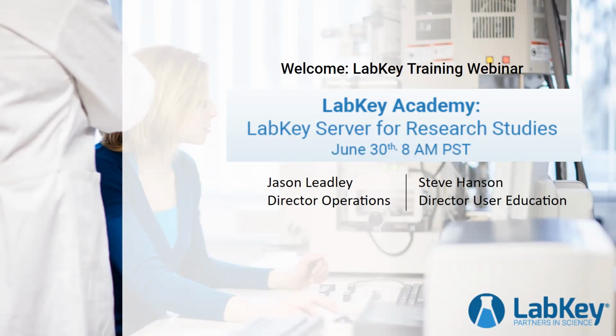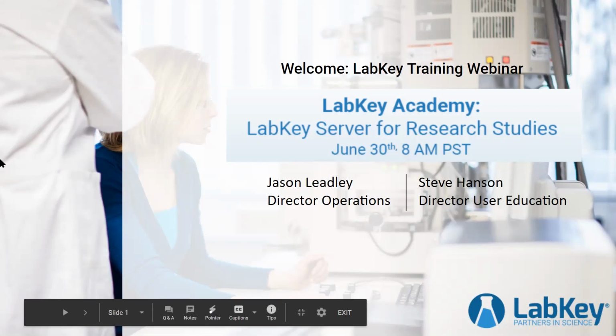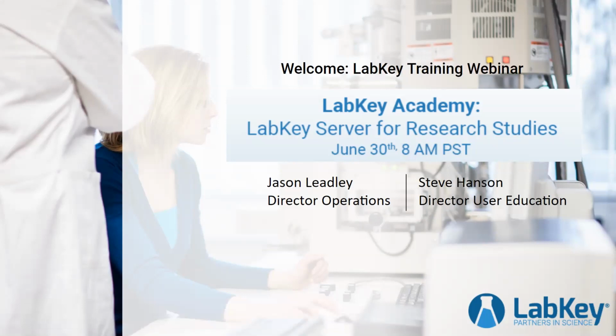And if you did join us when we ran a training webinar series earlier this year in April, thank you and welcome back. It's good to have you with us once again. It's actually due to the success of that webinar series in April and the feedback we received that we've decided to go forward with these additional, more frequent training sessions. These are intended to be more structured, more application specific, focused on real world use case applications of LabKey Server. So that's the kind of training that you've asked us to cover. So we're delighted to be able to meet that request.